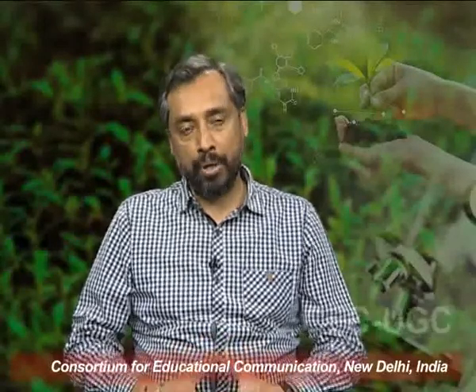Now let us talk about the basic components of an electron microscope. As we have already seen the basic picture of an electron microscope, we have also observed that it's huge in size and it contains different components.